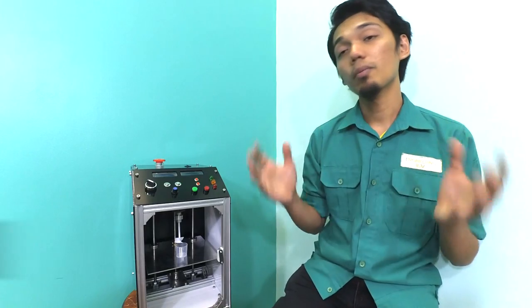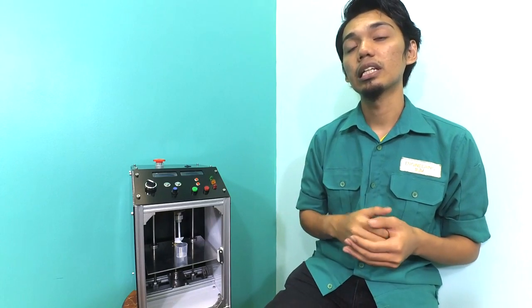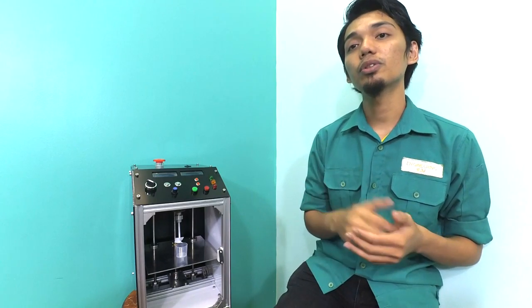I have an idea and I would like to call it Stirrer Machine. In our market, most stirrer machines require quite high amounts of materials that need to be stirred. This gives problems when very small amounts of materials need to be stirred due to expensive materials and testing purposes.